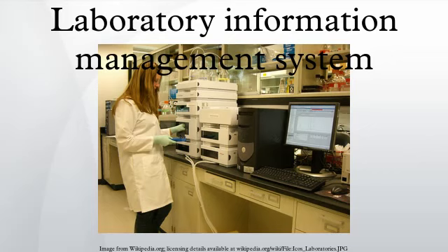LIS has tended to be used to reference laboratory informatics systems in the forensics and clinical markets, which often required special case management tools. The term PDES has generally applied to a wider scope, including, for example, virtual manufacturing techniques, while not necessarily integrating with laboratory equipment.